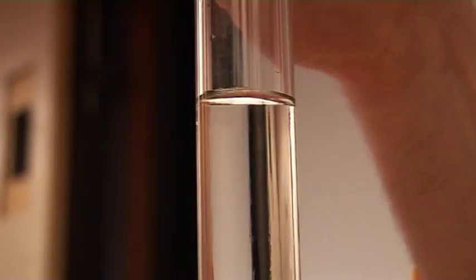But watch what happens if I just add a tiny crystal of ice to the top. It instantly freezes. So here it's freezing now.